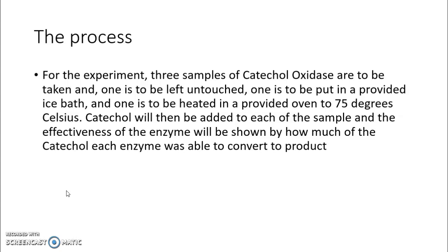And then these 3 samples will be collected and catechol will be placed in each one, so that afterwards we can check how much of the product that catechol oxidase produces after consuming catechol remains there. And we can tell by that exactly how much the catechol oxidase has retained its ability to function.